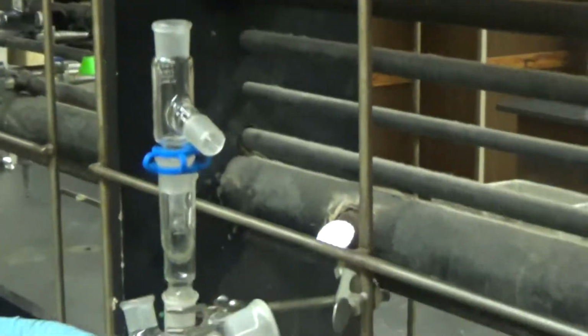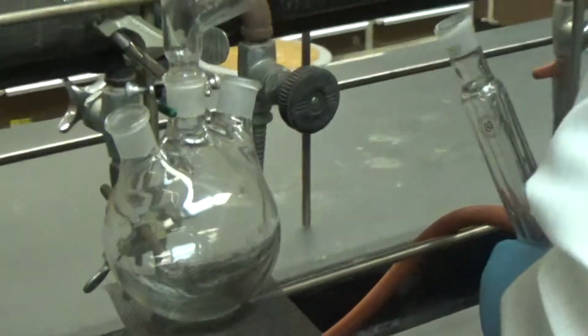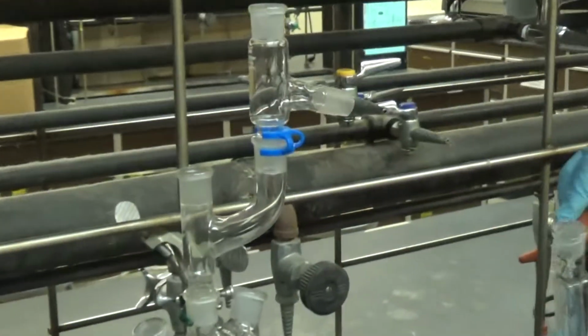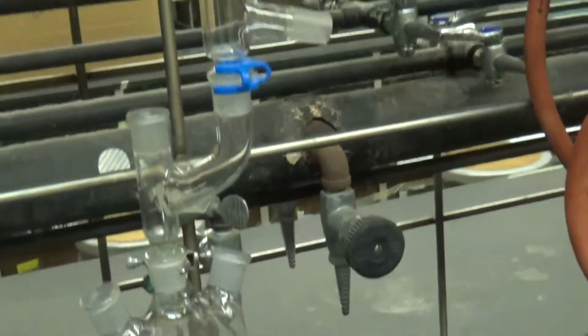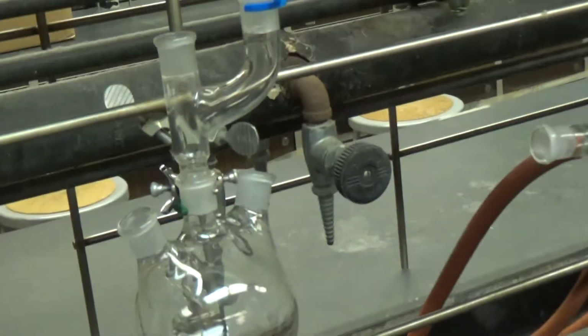Plug in the condenser water at the bottom, and out from the top. Water in at the bottom, out from the top. So you plug the water in, the water will be going in from the bottom and out through the top.